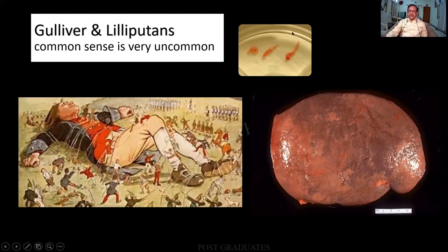So in this case, this amount of fixative itself is more than adequate and it is permeating from all sides. And in no time, maybe about half an hour, the fixation will be complete and we leave it for another 1 hour as a precaution. Whereas in this, if this splenectomy specimen on a Friday is left as it is to be grossed on Sunday or Monday morning, it is autolyzed. Because the thickness has to be penetrated, and as I told you, beyond 0.5 centimeters, it is not possible.